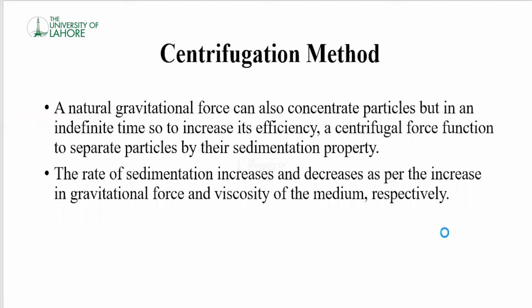Centrifugation method. Natural gravitational force can separate the particles, but it is time-taking. So, to increase the efficiency, centrifugal force functions to separate the particles by their sedimentation properties. The rate of sedimentation can be increased or decreased as per the increase or decrease in the gravitational force and the viscosity of the medium.